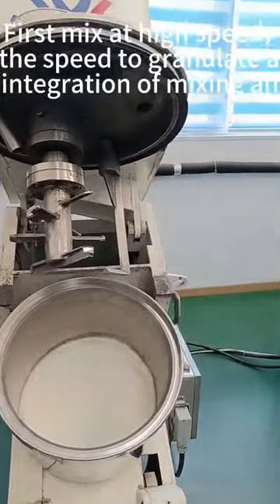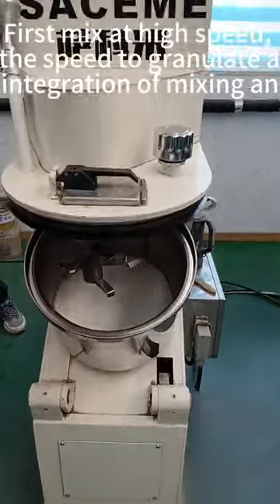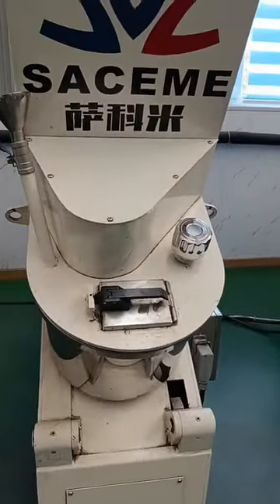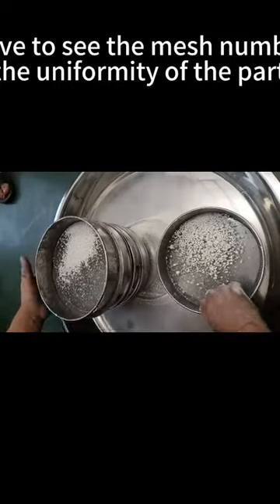First mix at high speed, then adjust the speed to granulate after mixing, to realize the integration of mixing and granulation. Set to see the mesh number and the uniformity of the particles.